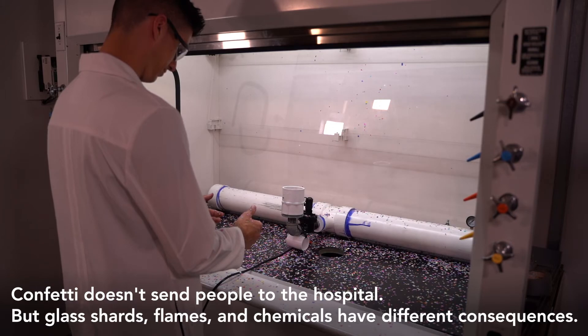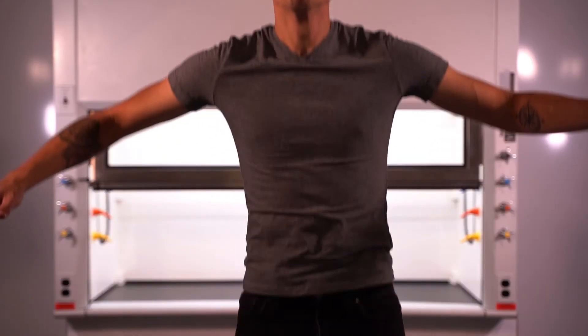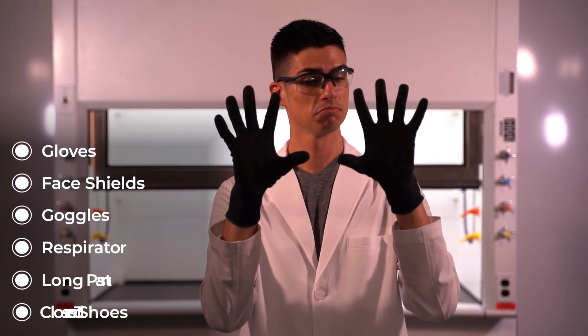Like fires, explosions are all too common. They're harder to predict and harder to prevent, and the damage is usually concentrated on those using the hood or those nearby. From the user's point of view, the fume hood is a PPE. It's also important to understand all the PPEs and safety devices a fume hood user should be aware of. Standards include a lab coat and safety glasses — they're a must. Gloves, face shields, goggles, and maybe even a respirator may be appropriate depending on what you're doing. You should also be aware of the fire extinguisher, eye wash, and safety shower, and know how to properly use them. The sash is there to protect you, and the degree of protection depends on how you use it.